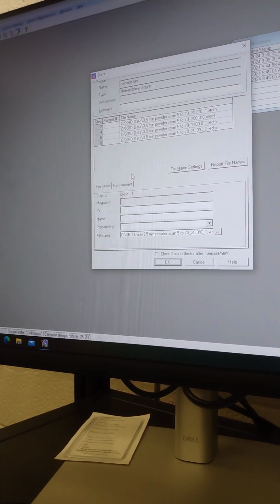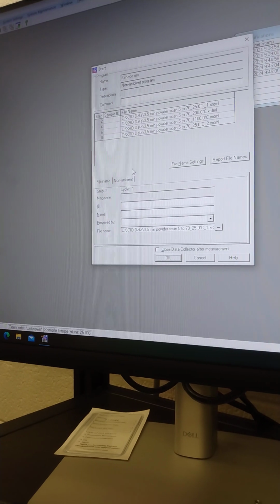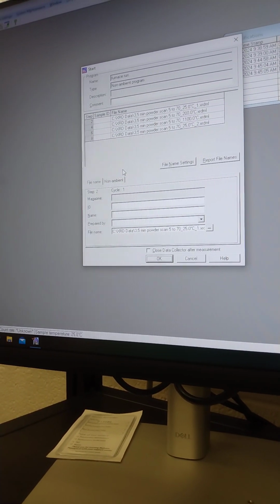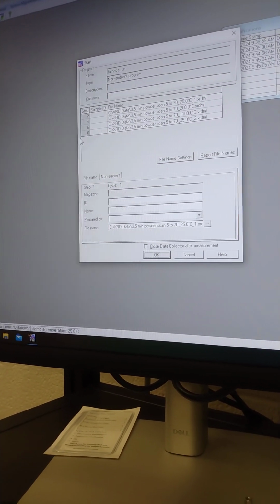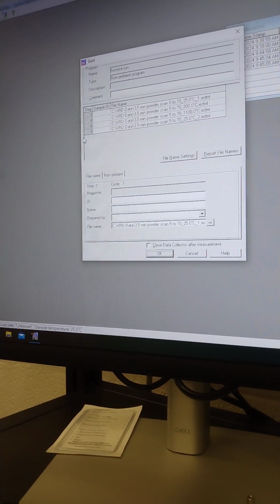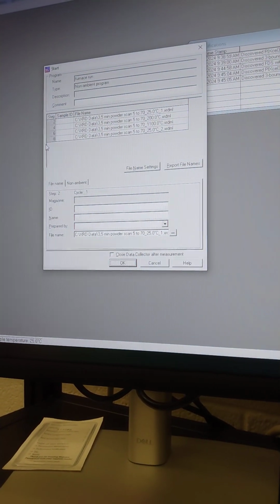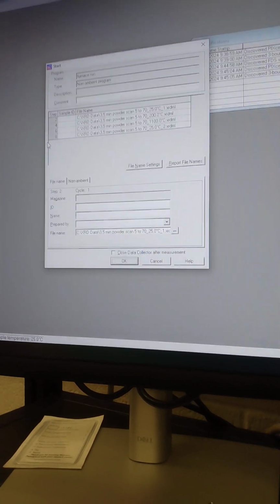The manual program is really just for sample alignment. So on this, every time you're doing a measurement, you're writing a program. Except that our programs are generic, so that's why we write, 3.5 minutes, 5 to 70. Now you can use this program anytime you want to go from 5 to 70 in 3.5 minutes.